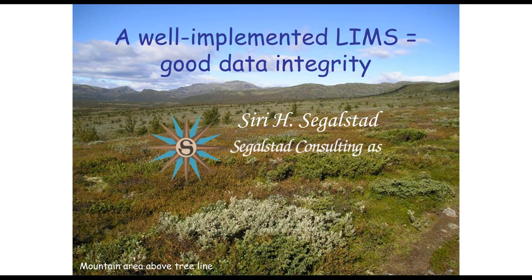Thank you very much for the introduction, and welcome to this presentation on how LIMS can help you with data integrity. I believe that most LIMS on the market have the technical functions to help. The big question is if it has been implemented correctly, and that depends on how the users have implemented their LIMS. During this presentation, I will first talk about what data integrity is and how it's defined, and then I will talk about how LIMS can help.